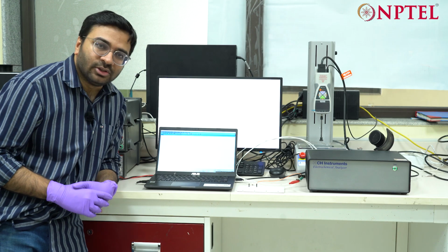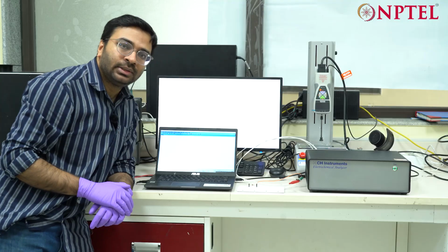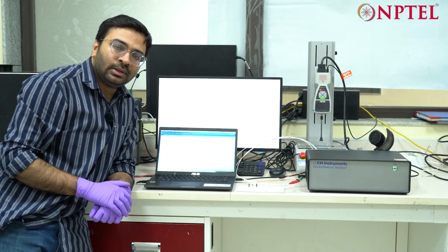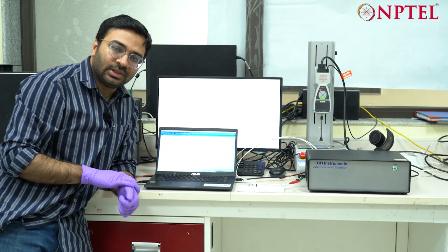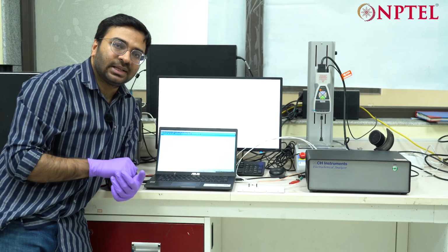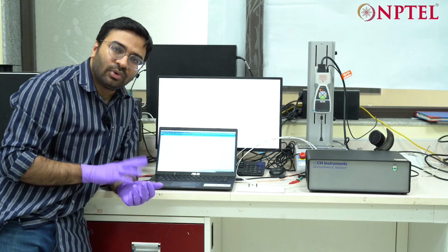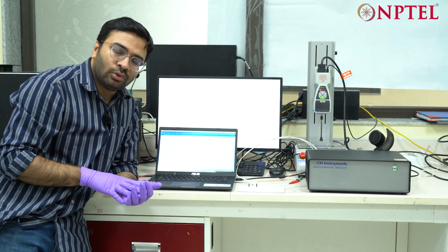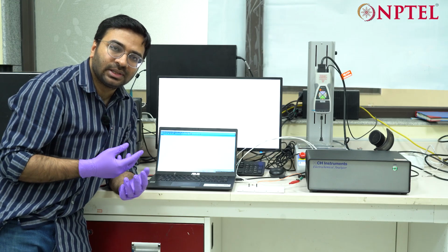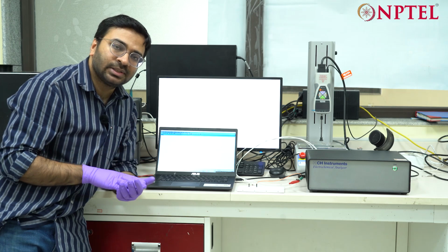So, this is another instrument, which is an electrochemical workstation. This particular instrument is basically used for chemical sensor characterization. This instrument has 4 different terminals. You possibly have seen electrochemical sensors in various literature or in various places.